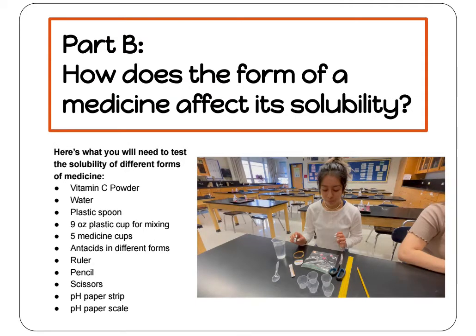Nice work with that last experiment. We just finished testing how different solvents affect solubility. So now let's see what happens when we change the form of our solute. Here's what you'll need for this experiment.